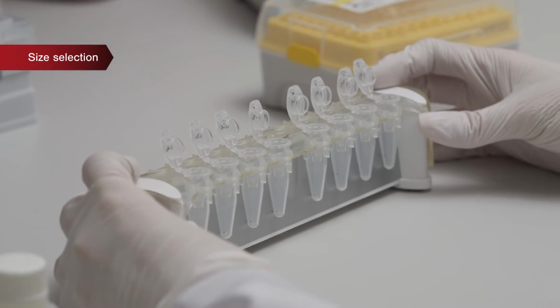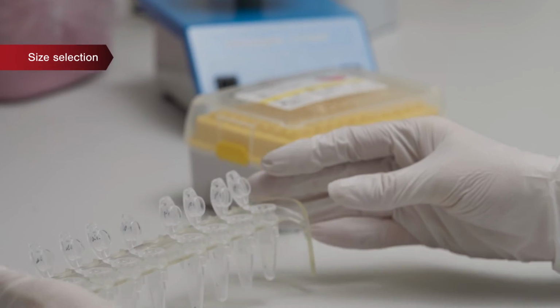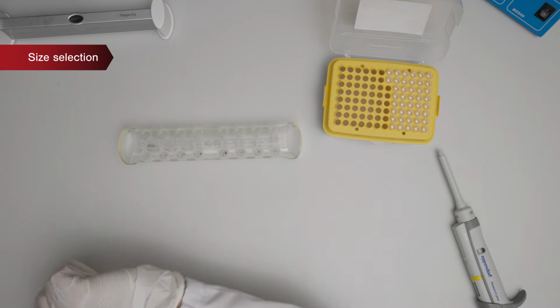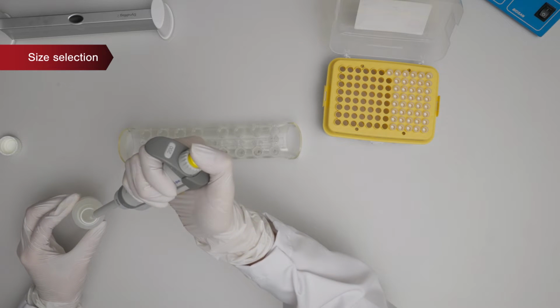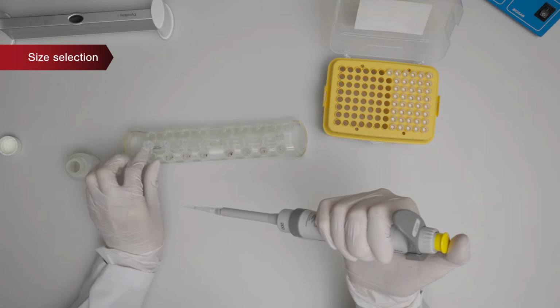At this point, you can take off the low-bind 1.5 ml tube from the magnetic rack and dilute the DNA in 32 microliters of TE buffer. TE buffer is made of Tris, a common pH buffer, and EDTA. It is provided in the kit.